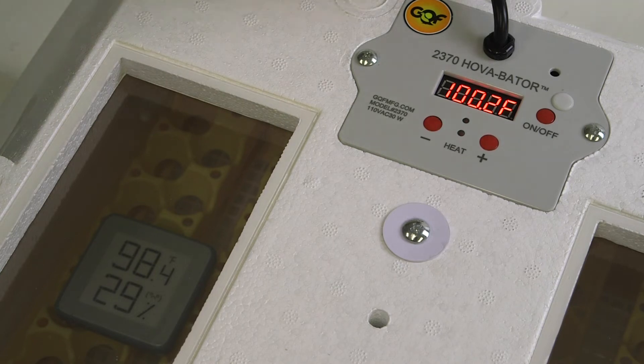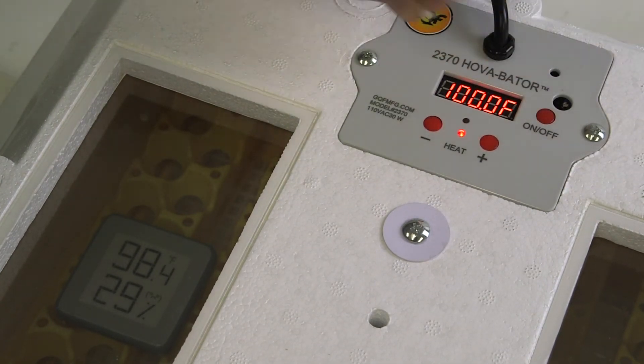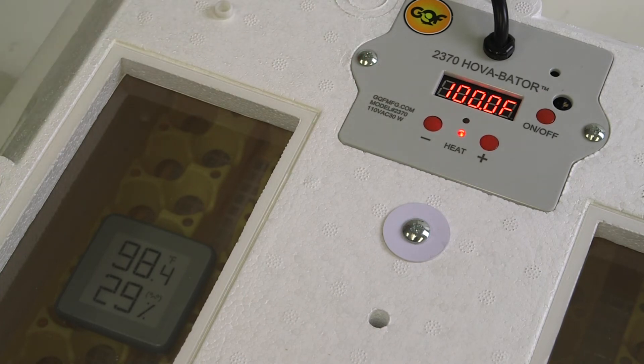To do so, just remove the small white plug just above the on-off switch. Inside, you'll find a small flat head screw that you can use to adjust the temperature.